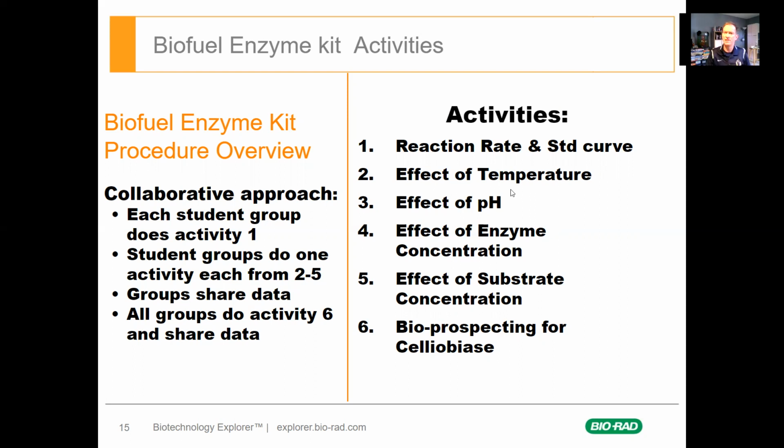We're going to see what the best temperature, the best pH, the best enzyme concentration, and the best substrate concentration are, given a little freedom for the best. Then, taking your foundational exercise, your second day of lab, where you're going to do temperature and substrate, when we come back together, we're going to bioprospect for Cellobiase. You're going to run a reaction on a tissue sample. What do I mean by that? You're going to bring in mushrooms, different types, and squish and mash them around, and we're going to try to get some Cellobiase.